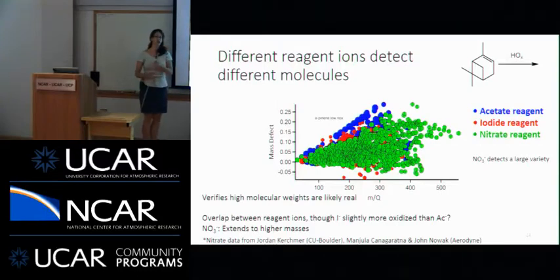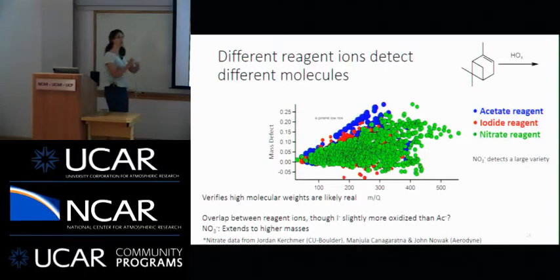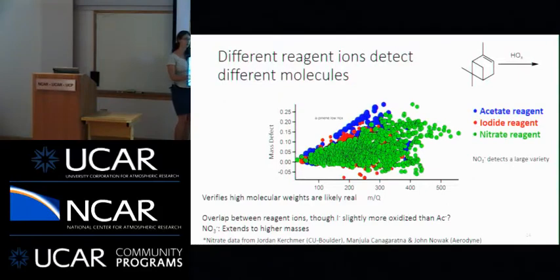But what we do get is with acetate, we get some of our molecules combining with acetate ions. And so instead of being over here, that molecule is now over here on that figure. So some of these dots can be a little misleading, and I think that's a really important point to take home from these bulk measurements: be very careful with interpreting every single dot as a single molecule in the atmosphere, because some molecules get double counted.